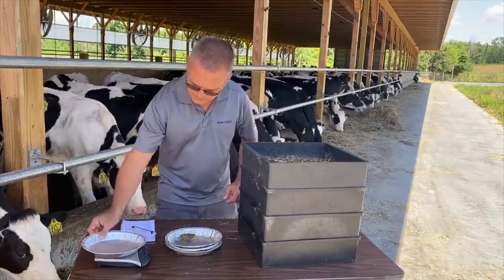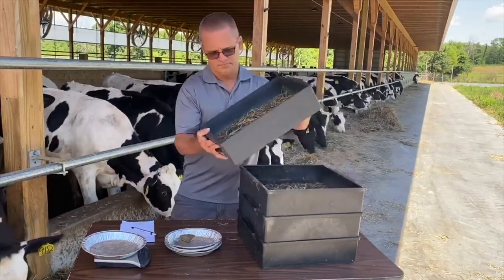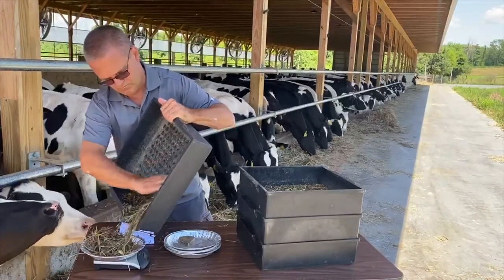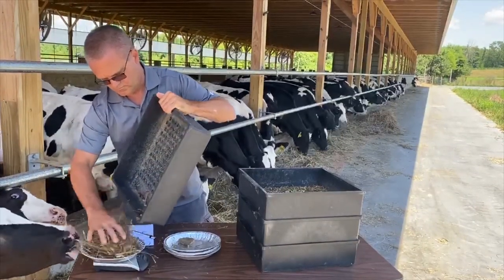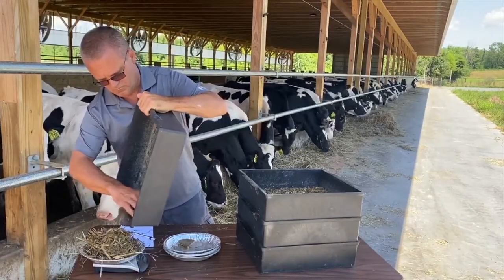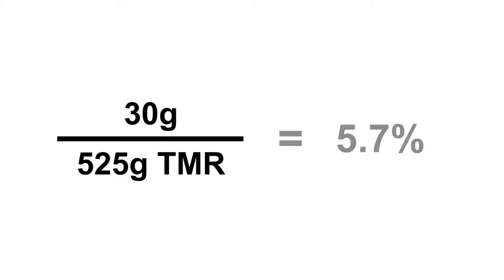It is important to remember to move the boxes with enough force so that the feed or TMR is able to pass back and forth over the holes, allowing the pieces to pass down through all three screens. Once the sample is separated, the feed remaining on each sieve is collected and weighed individually. To determine what percentage of the sample stays on each sieve, divide each captured set of particles by the total weight of the sample. For example, with 525 grams of TMR to begin with, we measured 30 grams left in the uppermost sieve, meaning 5.7% of the sample.